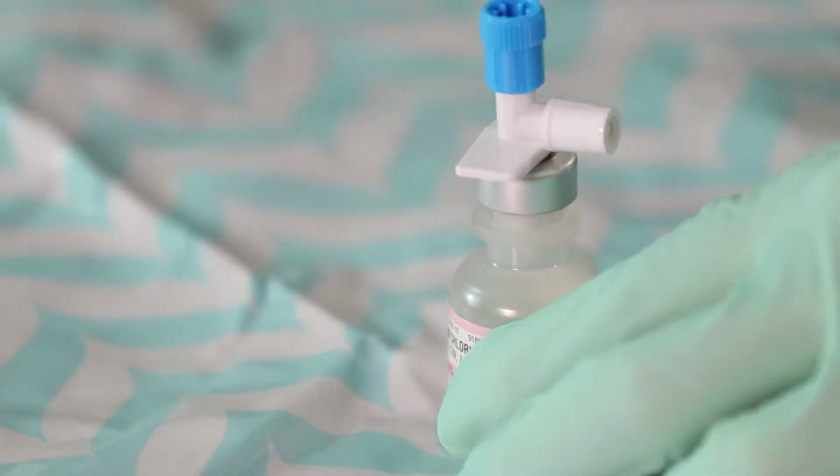No more than 2 entries into any one container. Use a mini spike for multiple entries into a single dose vial. If using a filter needle when drawing up medications, you must change to a regular needle before inserting into the bag. Be sure to start the infusion within 1 hour of mixing. Contact the clinical pharmacist supervisor if there's a delay for further directions.